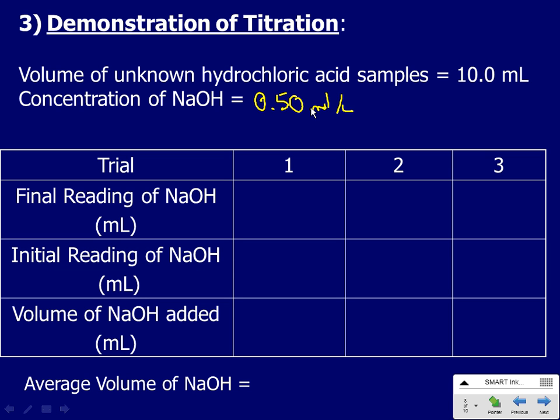Add your phenolphthalein, 2 or 3 drops, doesn't really matter. I got 4 drops there, doesn't matter. Going to add a little bit of water here so that I'm ready for when I need the water. Put that right there. And now we're ready to titrate, all right? I've got the indicator in there. As soon as it becomes basic, it'll become pink. And I've got enough water that I can swirl.